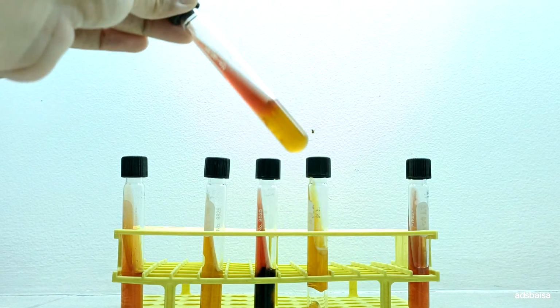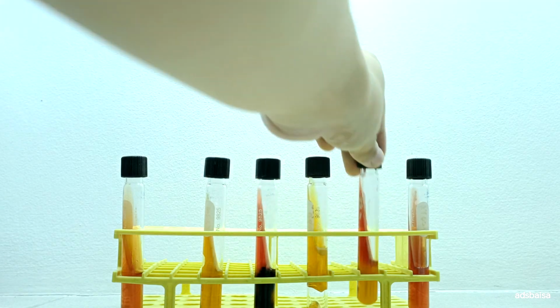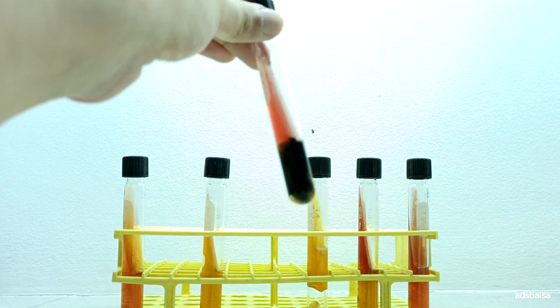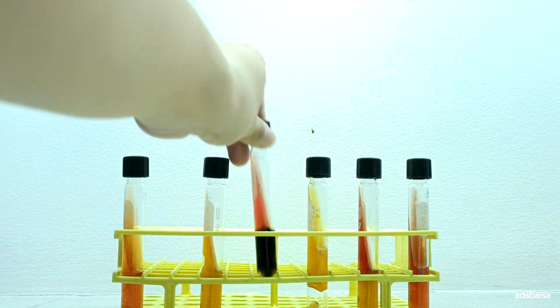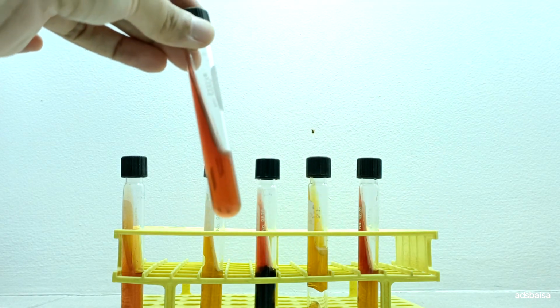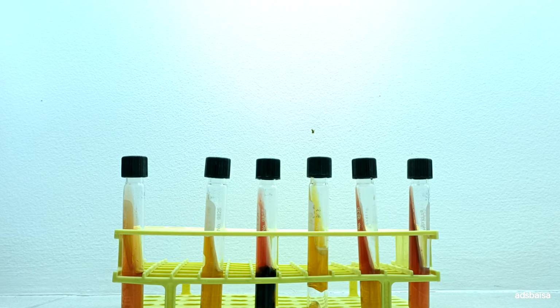K over A, meaning that glucose was the only sugar fermented. And K over A plus H2S, meaning glucose was fermented and hydrogen sulfide was produced. For the K over K, meaning no sugars were fermented. So that's how we perform the triple sugar iron agar test, and that's how to interpret and report the results.